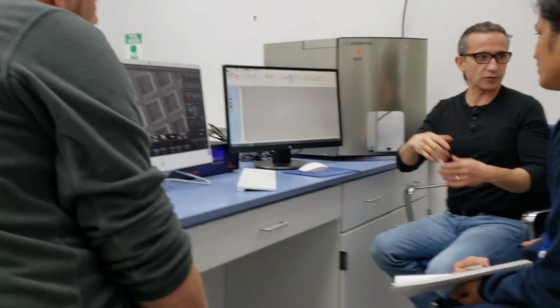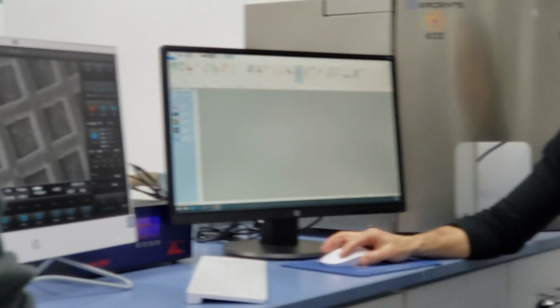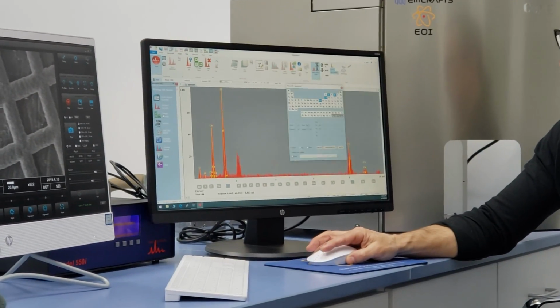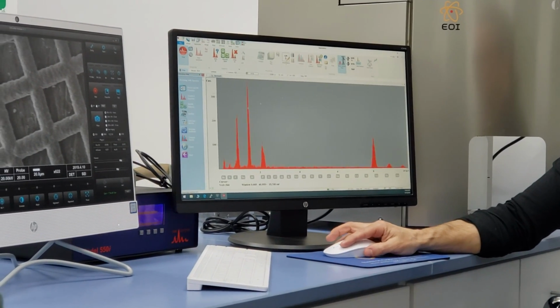Great. We just want to make sure we're over 1,000 counts a second, right? Over 1,500 counts. Yeah. Okay. Working with spectra, okay. Acquire the spectra, great. I go down to ID it. I could label whatever I want to label. Great.